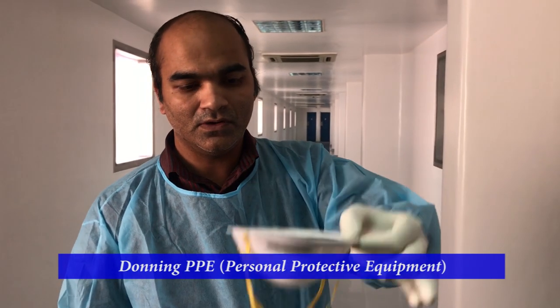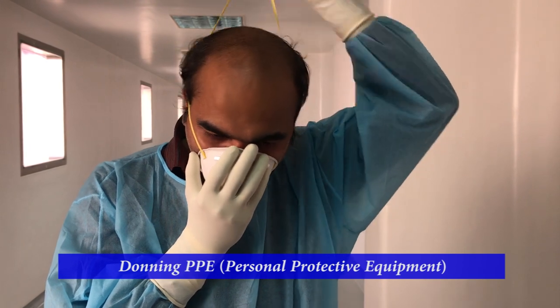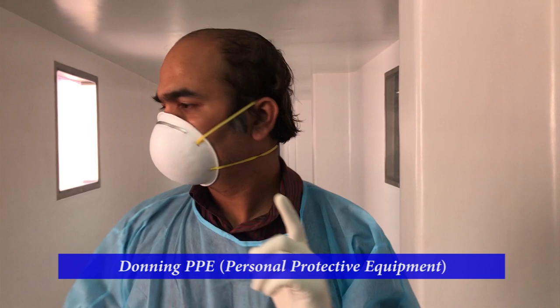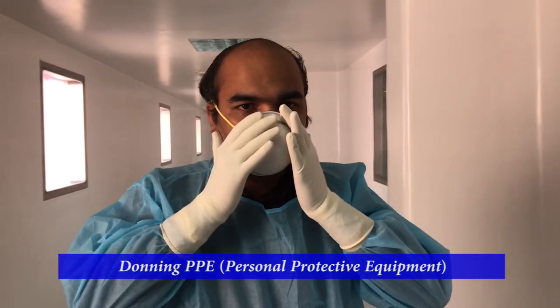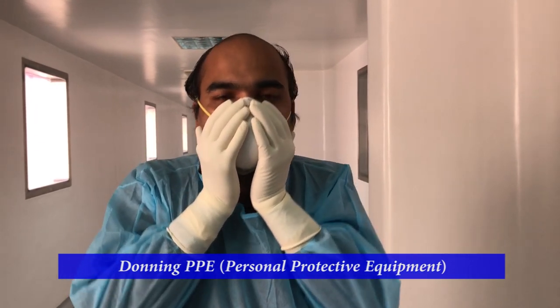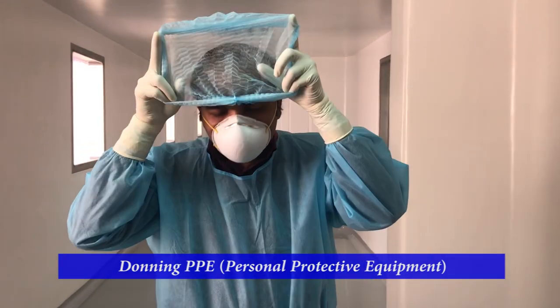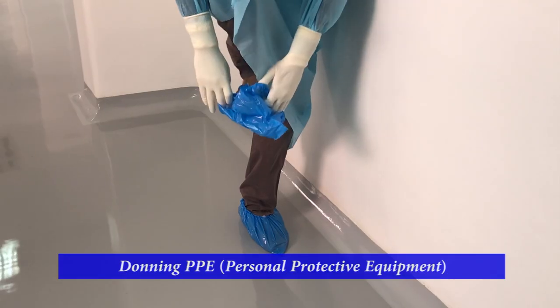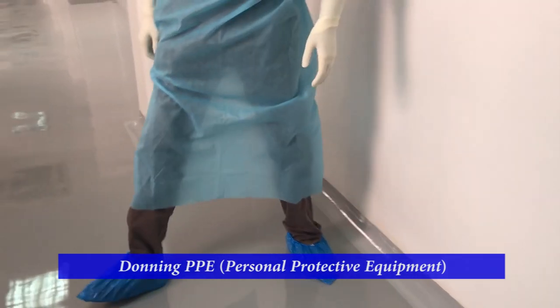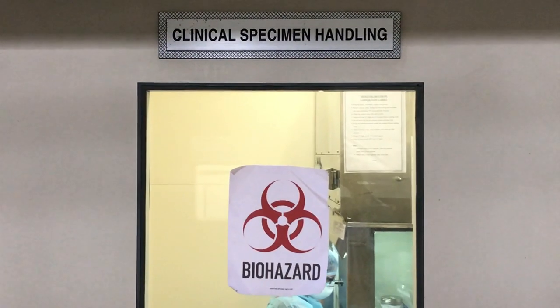Next, take the N95 mask. Hold the mask as shown with the metal clip on the top side. Fit the mask on the nose and move the lower elastic first over the head and below the ear. Press the metal clip above the nose for snug fitting and do the fit test by breathing out. Don the head cap and the shoe covers as shown. Finally, cover the face either with a face shield or a pair of goggles. You are now ready to work.